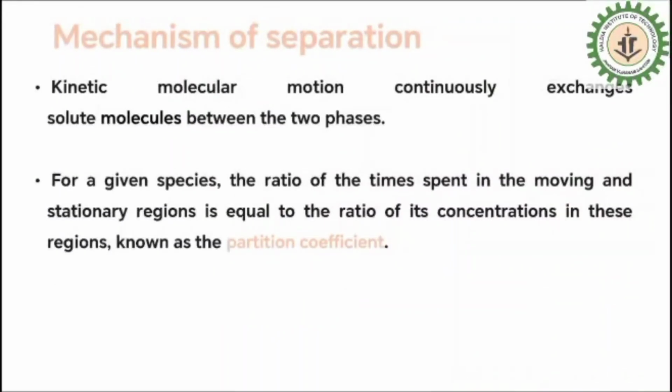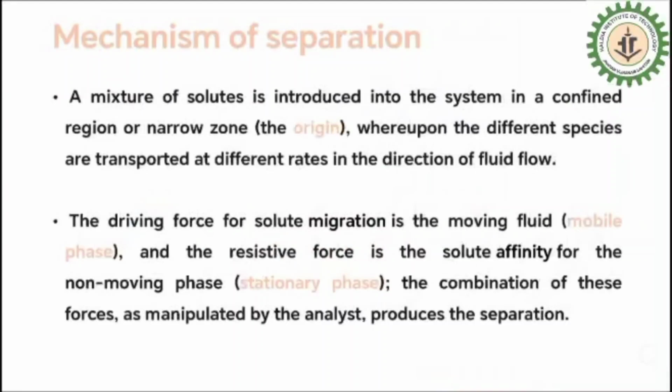The mechanism of separation depends on the kinetic molecular motion of the solutes present in the mixture. Kinetic molecular motion continuously exchanges solute molecules between the two phases. For a given molecular species, the ratio of the time spent in the moving phase and in the stationary phase is equal to the ratio of its concentrations in these two phases, known as the partition coefficient.